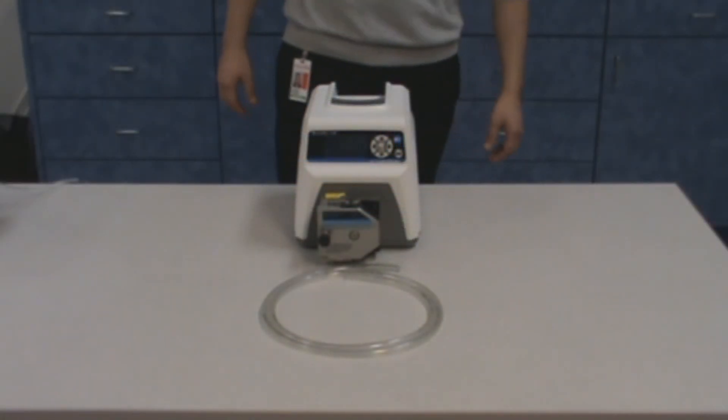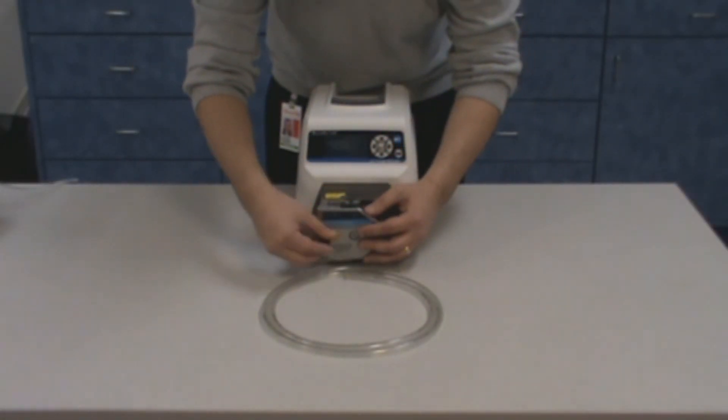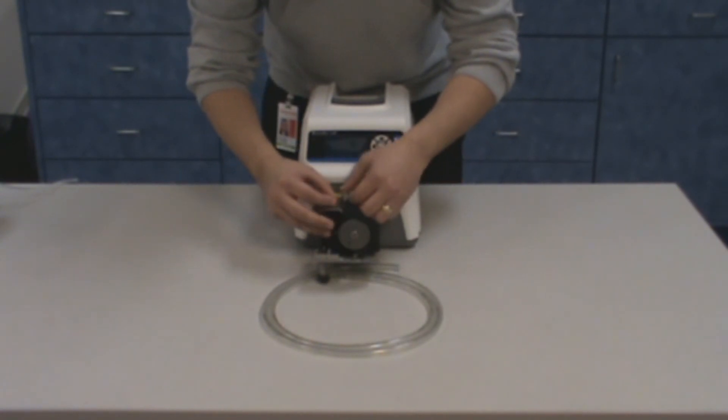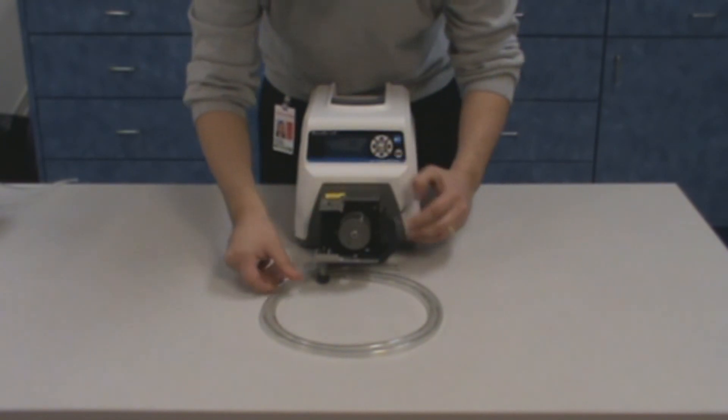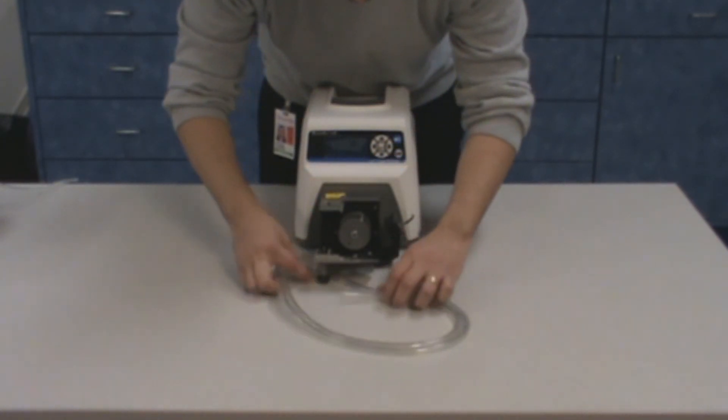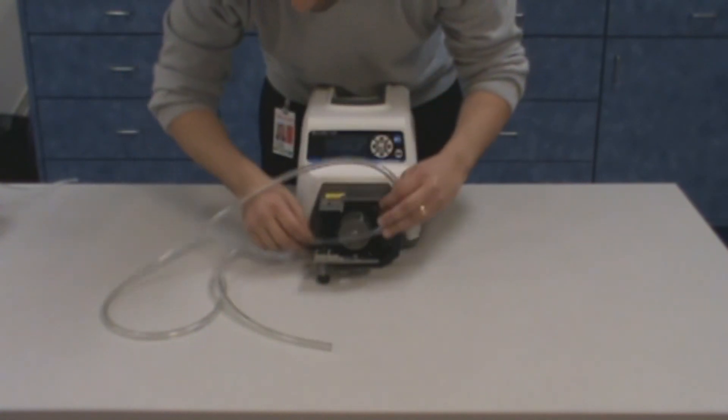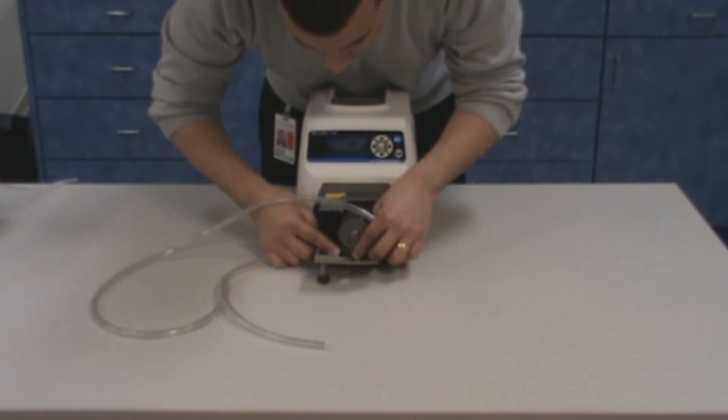To begin, rotate the tubing retainer knob counterclockwise to release the retainer and then pull open the cover. Next, lift the latch to open the occlusion bed and insert the tubing inside of the tubing guide. Insert the tubing around the rotor with the ends of the tubing extending out of the tubing entrance and exit. Make sure to center the tubing on the roller.